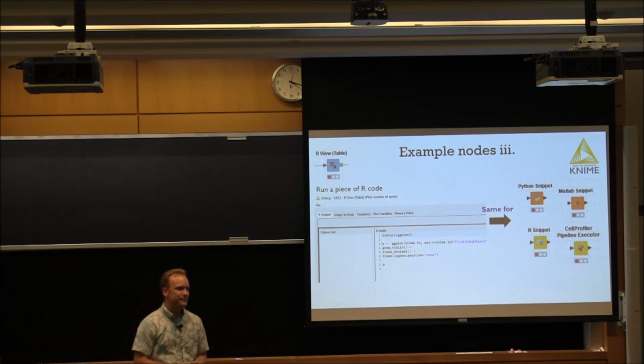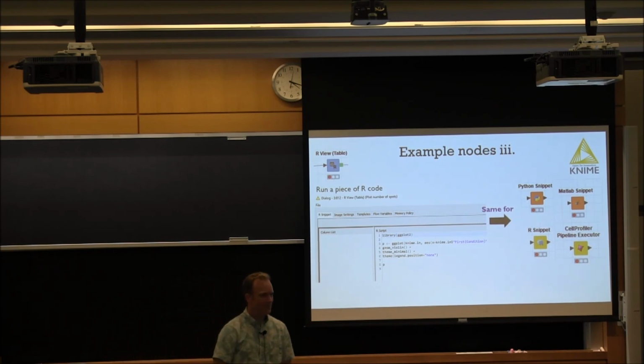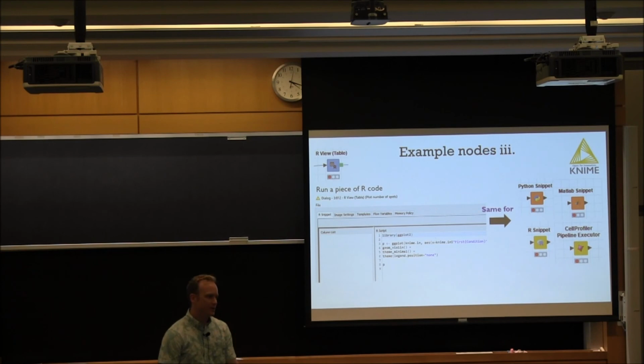Is there a way that we can use this in a cloud computing environment? I'm sure there must be, but I don't know. But I'm sure there must be ways to do it on a bigger computer. I was talking with research computing, and because it's Linux based, you could install it on the cluster and then run your image processing there. You have the visual interface for research computing, so then you would have a lot more power to pump into your pipeline.